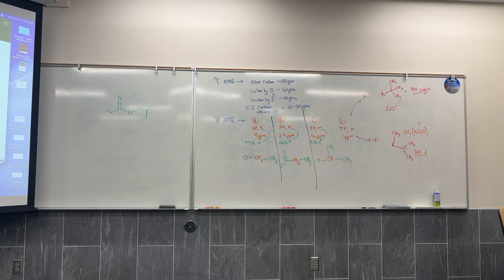which is a lot. Yes, I agree, but I can actually define this more to say that I've got 1, 2, 3, at least 6, but maybe up to 8 carbons, I think that I've got 2 oxygens.